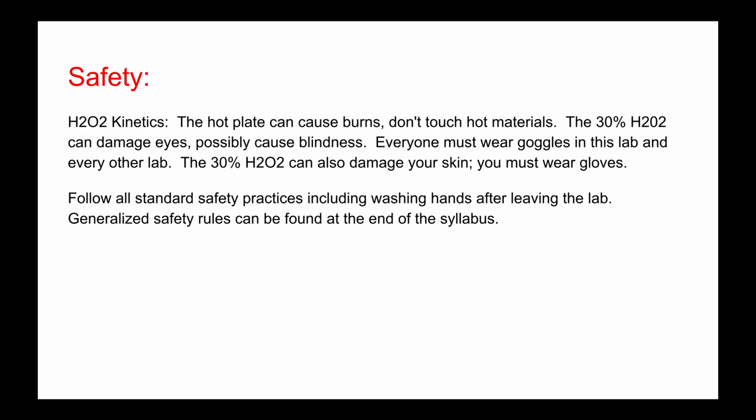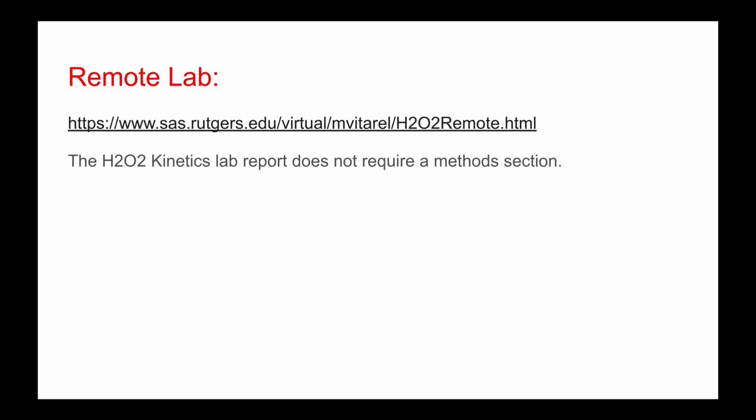The 30% H2O2 can blind you, and it can also damage your skin, so everyone must wear goggles and gloves. Incidentally, everyone must wear goggles in every lab. Okay, now to the virtual experiment.